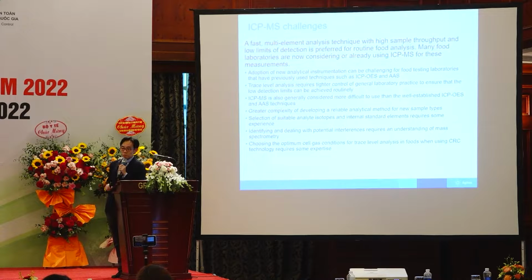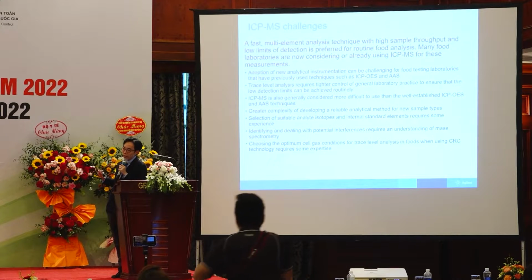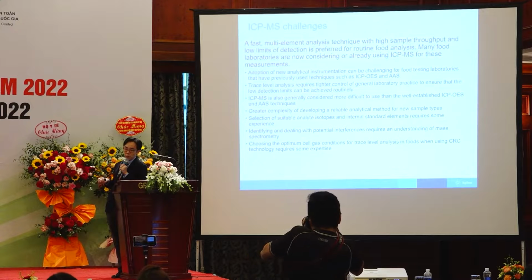So what are the challenges of ICPMS? This is a very wordy slide. But generally it's agreed that ICPMS is a very fast, multi-elemental technique that a lot of labs would like to adopt for elemental analysis. But of course, adoption of these high-end techniques can lead to some problems.